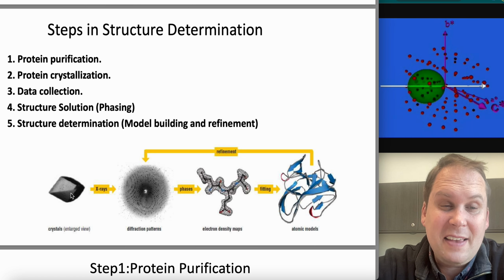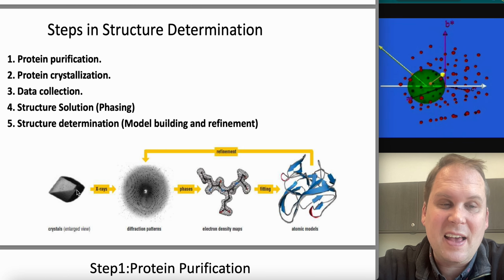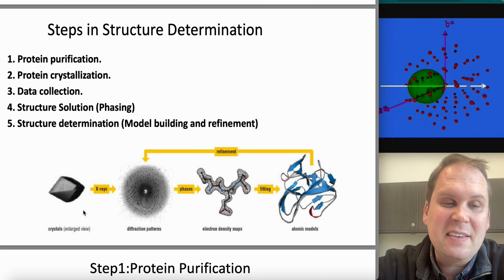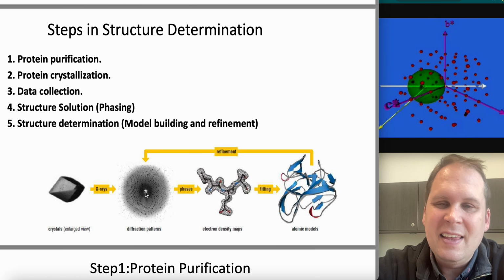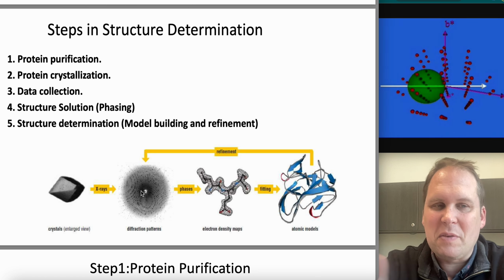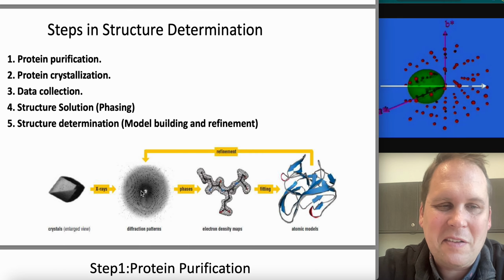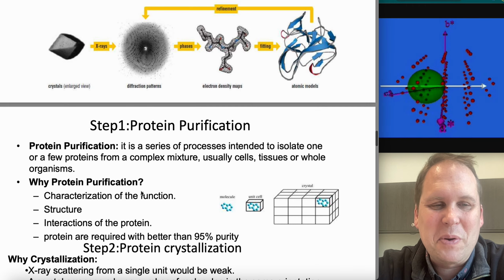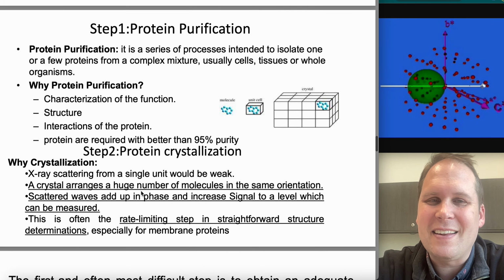Getting it to crystallize, very error prone. You'll get maybe 5% of things to crystallize. Of the ones that crystallize, only some of those will diffract meaningfully, in a way that you can solve it. So now you're down to something like 1% of the proteins you try will actually come out the other end and you'll be able to solve it. So it's pretty brutal work, but I'm glad people do it because they're just the best pictures in biology.